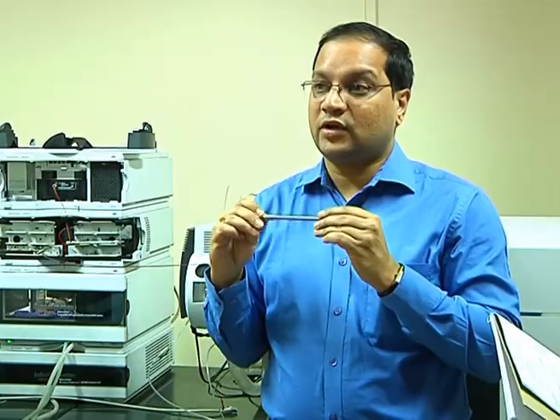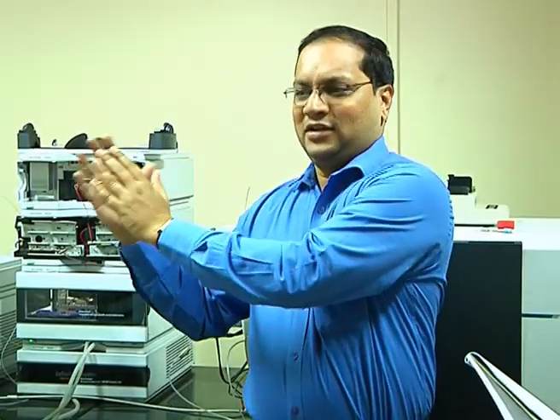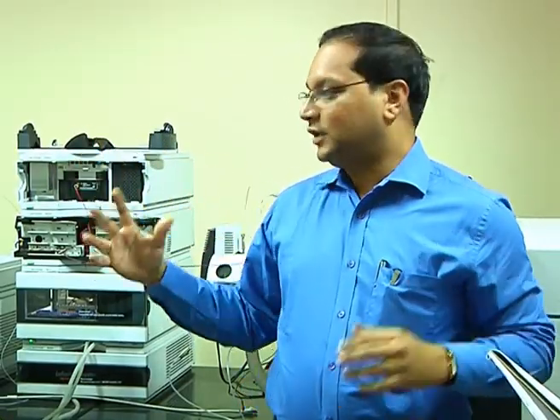The peptides get retained based on their hydrophobicity, and then you elute them at different time intervals. So of 10,000 peptides, 2,000 will come at 1 minute, the next 500 at 2 minutes, like that. Then you split all those, and your TOF, or your MS, can see them with its full capacity, and you won't miss them. That is one, to reduce the complexity.